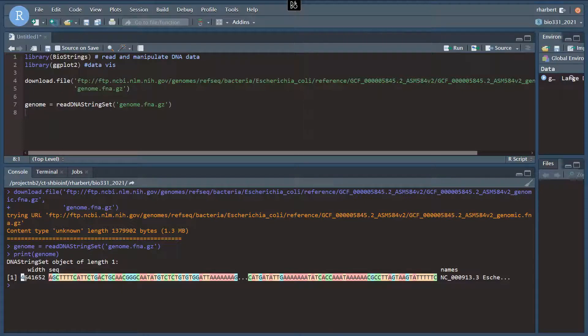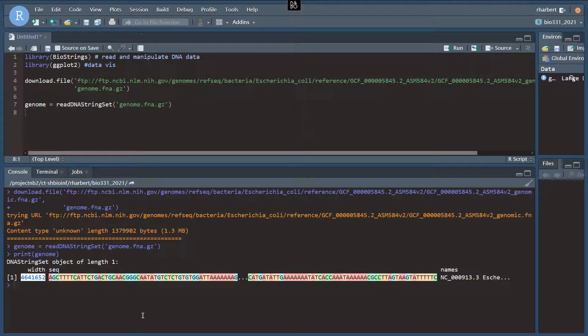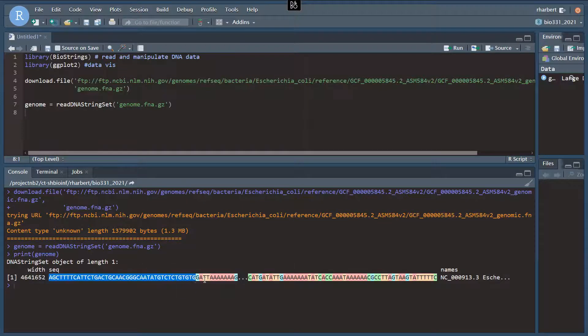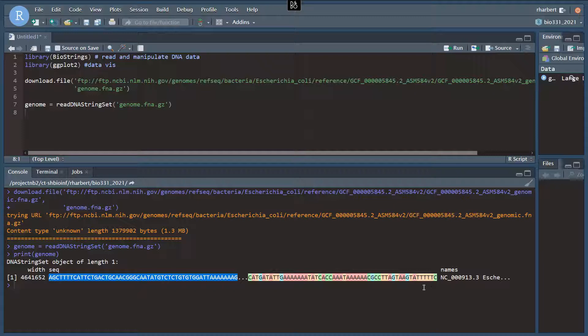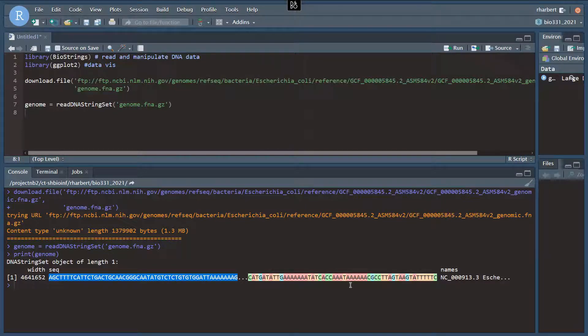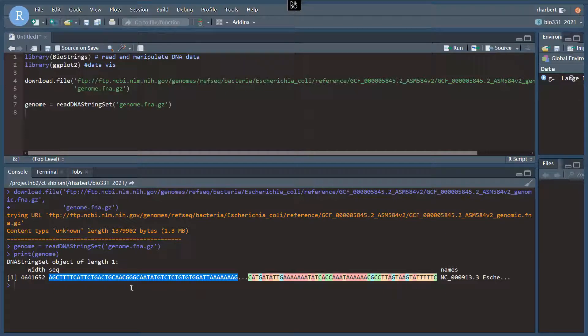Of length 4,641,652 nucleotides. And then it shows us in the seek attribute here. First and last parts of the sequence here with 4,600,000 nucleotides in between.